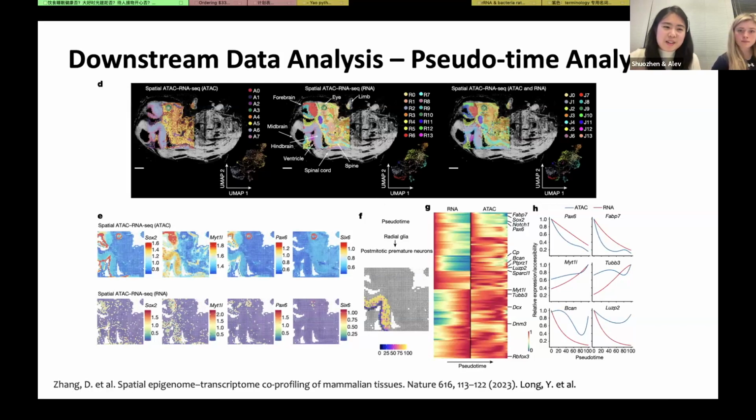And there were some errors while we were running the script. Very sorry for that, but we hope this hands-on workshop provides you different package information and guidance that you can explore. The environment that we provided in the script and the demo data should give you fun materials to explore for multi-omics. Thank you so much.